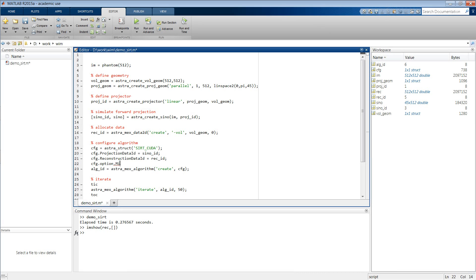specifying that you want to have a min constraint, and that you want this min constraint to be at the value 0. You can also have here another value as you please.